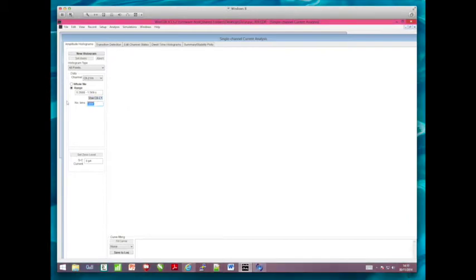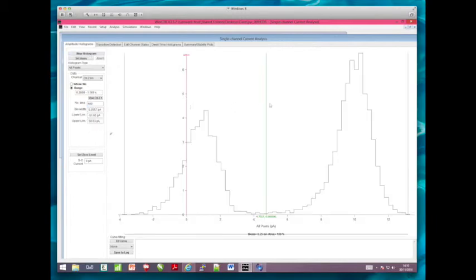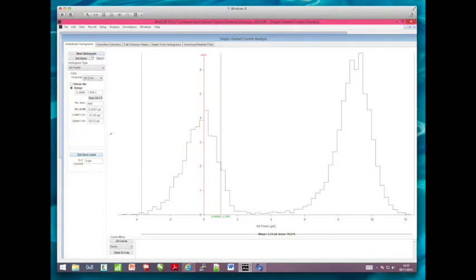I think I'll probably have more bins than that. I think I'll use 400 bins, and then I simply go. And I've got that right. Okay, so my 0 is all a bit funky. My 0 isn't really where I want my 0 to be, so I'm going to move the green cursor to about where it looks like it's a 0, and then I'm going to re-zero it down here by hitting the re-zero button. Now I'm just going to regenerate that histogram again.